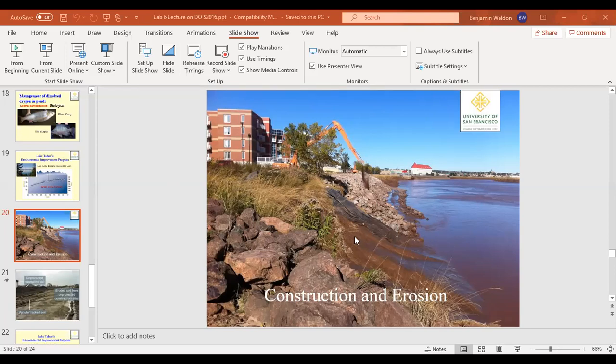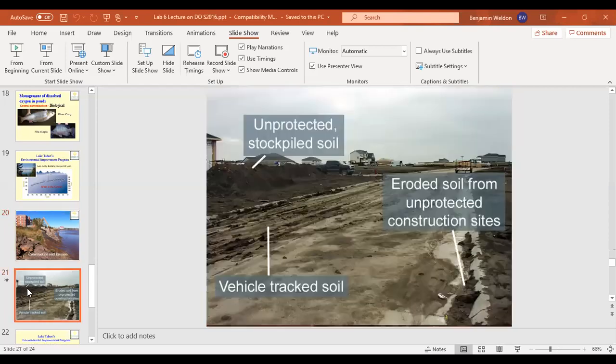It would be simulating taking a sample from the river on the right and testing that, and then we would have let the sample sit for an hour while we did the DO, or dissolved oxygen, portion, and then you would have taken another reading after 1 hour had lapsed to see how quickly it takes different types of sediment to settle.